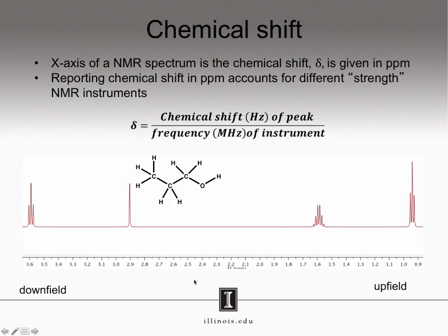To calculate ppm, we take the energy of the signal we measured from the NMR experiment, which is measured using frequency, the unit for which is hertz, and then we divide it by the strength of the spectrometer, which is measured in megahertz. Look at these units. Hertz over megahertz. 1 over a million. That's where the parts per million unit comes from.